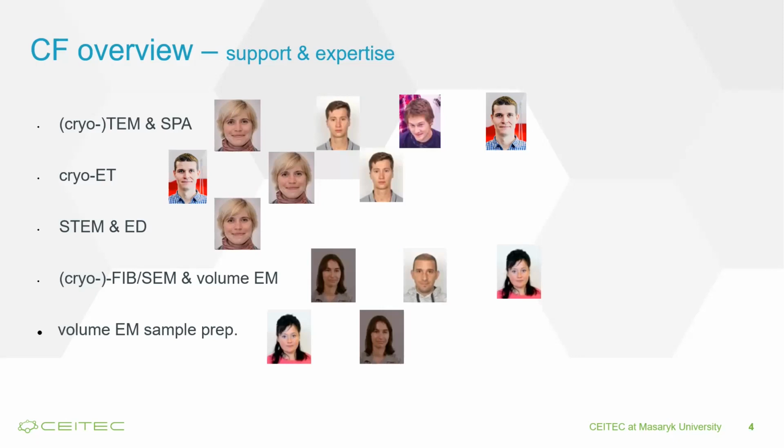For cryo-electron tomography, which our users are generally expanding on, it is Karel, Zuzka, and Dan who will be the main people. Colleagues from chemistry have probably already met Zuzka for scanning transmission or electron diffraction, and for cryo-FIB and, more importantly, volume imaging, which I will touch on a bit later on.